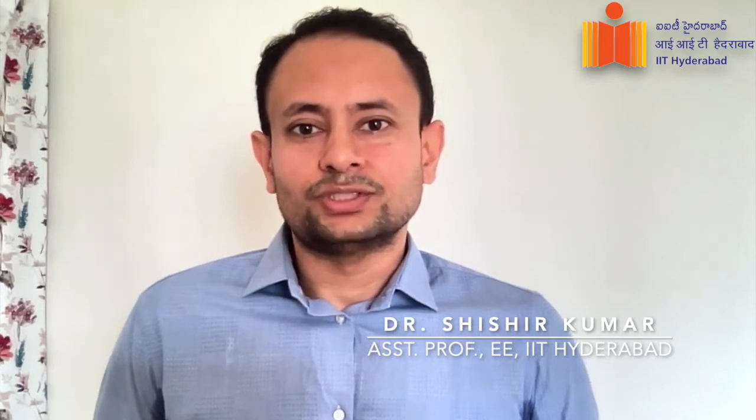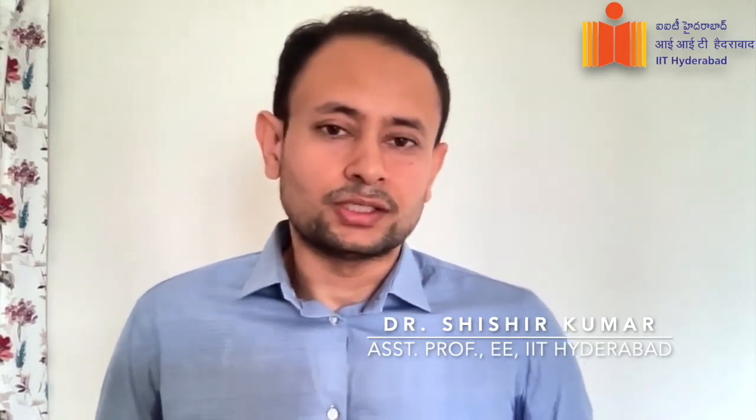Today I'm going to tell you about a miniaturized microscope that we have developed recently. As you may know, optical microscopy is one of the most important and widespread techniques to look at biological matter, both in life science research and the medical care industry.